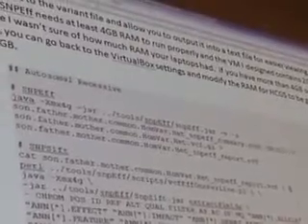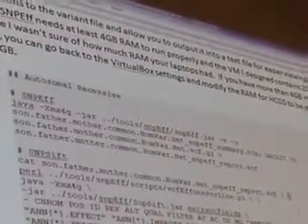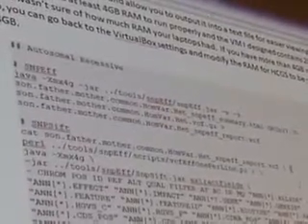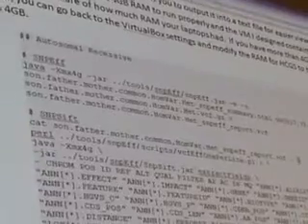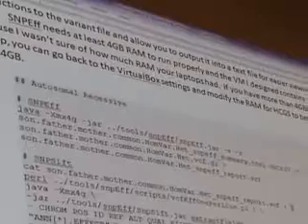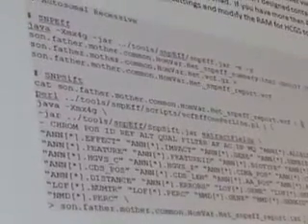But what you see is I had these backslashes here, and that allows you on the command line to break it down into rows and see things a little better, especially when you're writing a bunch of code. It just says, hey, I'm not yet done, go to the next line. There's more parameters and options that I'm telling it. And you'll notice that the very last line does not have that backslash. So it's basically saying end, and that's my entire code. So just an FYI, when you see me have these backslashes, it's just for easier viewing for you. And you need to include those if you're going to write it line by line. You need to make sure you keep those backslashes there.